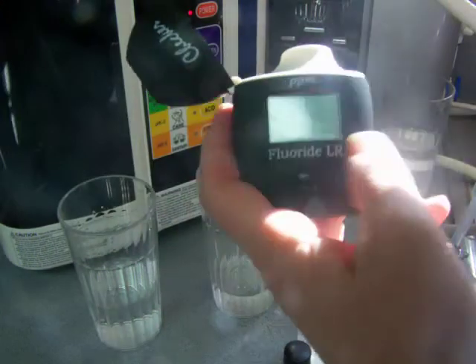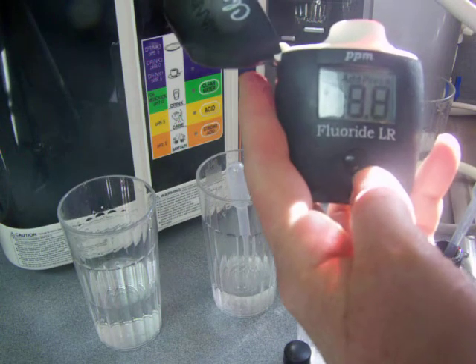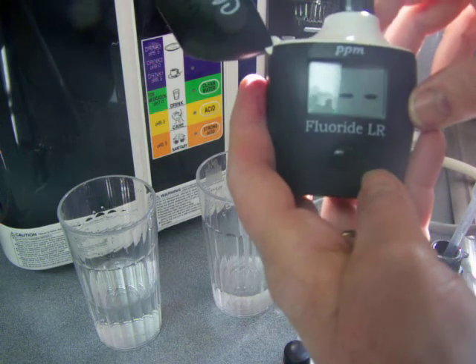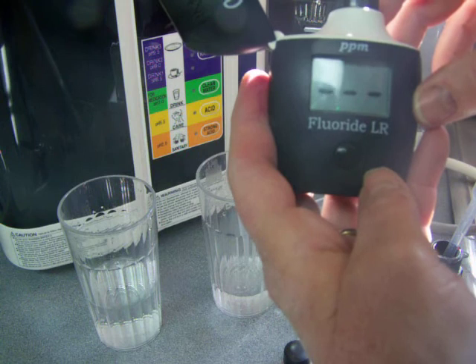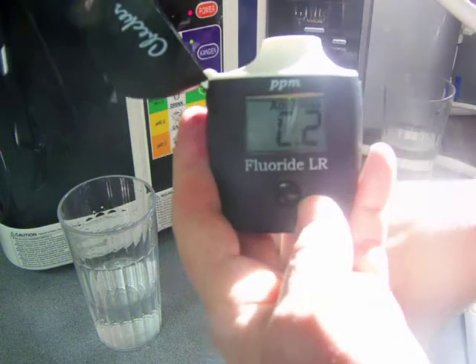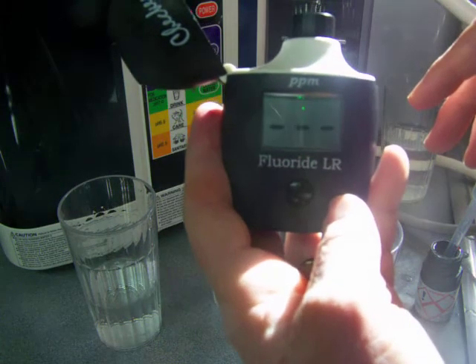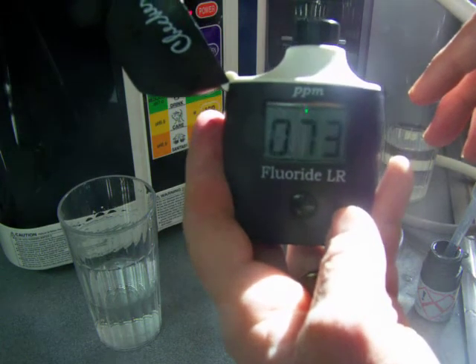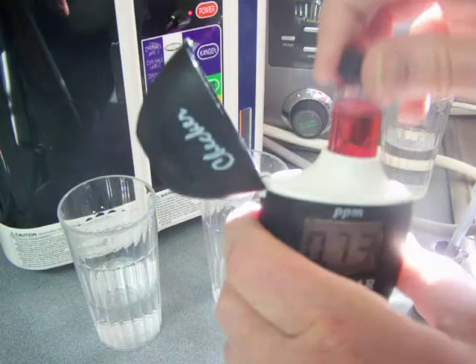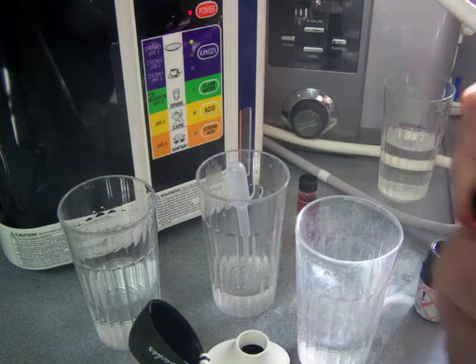Let's look at St. Louis tap water. It says add C1 — this is the control — and I'm going to press. Add C2, that's my tap water, and I'm going to press. So it's saying that my tap water has 0.73 parts per million of fluoride.